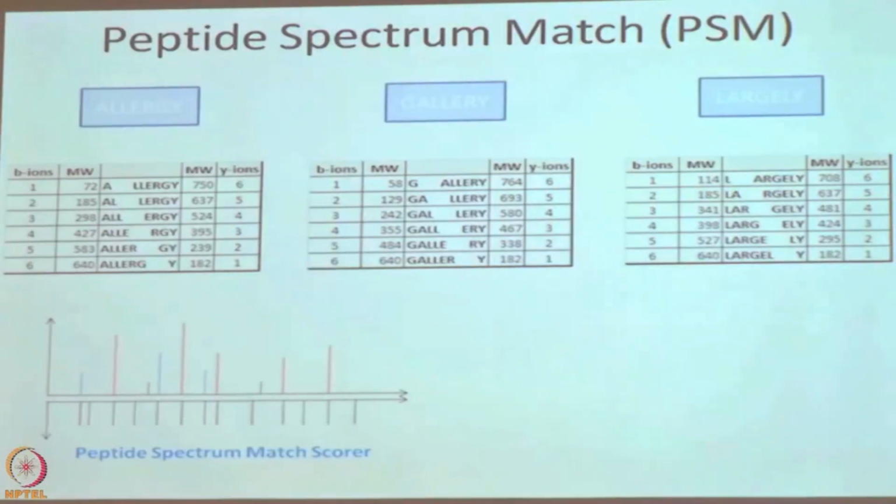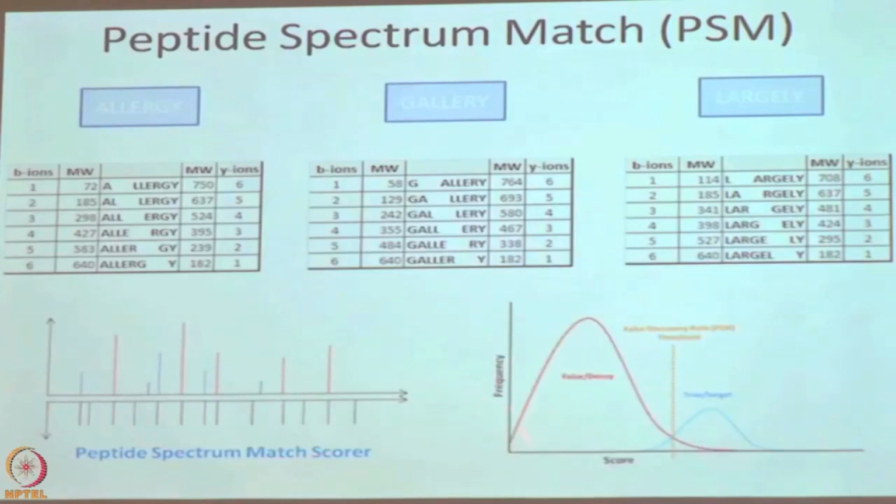To do that, people take this approach. They create a decoy database. A decoy database is a falsified database, a database which does not contain the natural proteins. So, the proteins are read from right to left maybe, or randomized shuffled sequences, along with the target sequences. And when you draw a threshold, that threshold divides the true positives from the false positives.